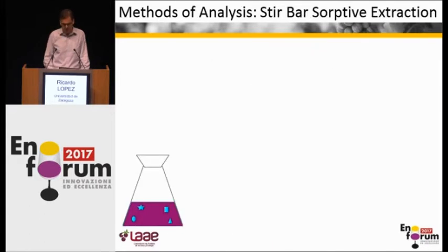Okay, with this, after these treatments, we analyzed the wines, and we used several analyses depending on the concentration and the type of volatile that we were analyzing. These different methods depend on this concentration. For example, for a family of compounds that is important for the aroma of Sauvignon wines, like alkyl methoxypyrazines, we use a method based on a stir bar covered with a sorbent.